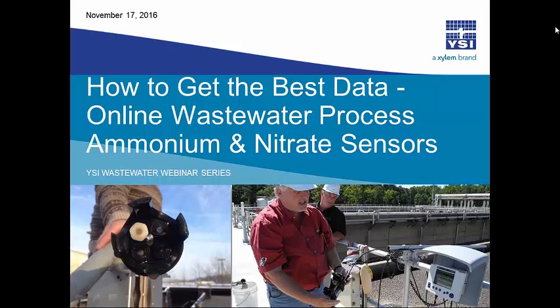The pictures in the panel here on the title slide show on the bottom left the business end of an ammonium and nitrate sensor, which we'll be discussing in greater detail. And also on the bottom right panel is a wider angle view of a monitoring system. The probe again is out of the water and mounted to the handrail with a boom and chain, which is one of our most common mountings.